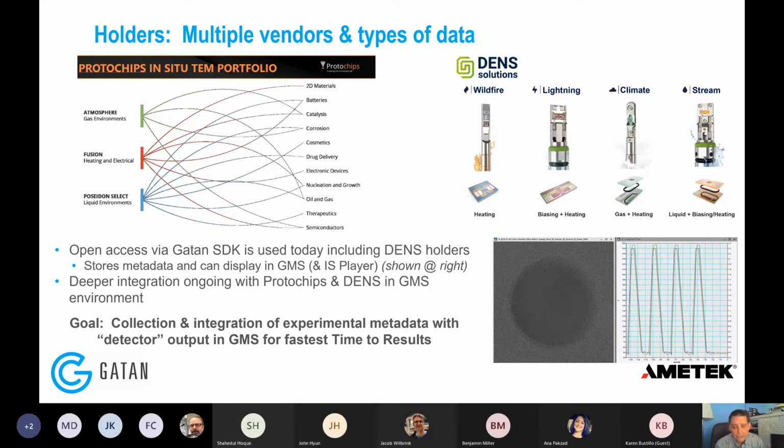And so the in situ data we show you today, for example in the bottom right, you see that we can display, this is an example of a temperature rise and fall experiment. And you get the images associated with that. You can actually query on the temperature map here, say I want to see the image here, and it'll bring up the associated image. And so these two displays are linked in that sense.